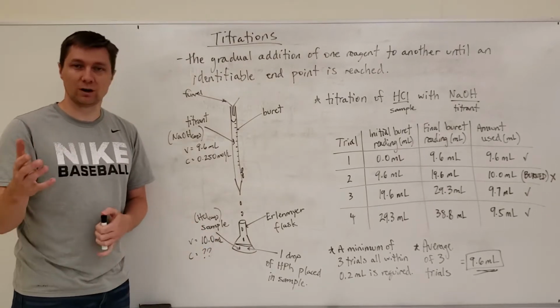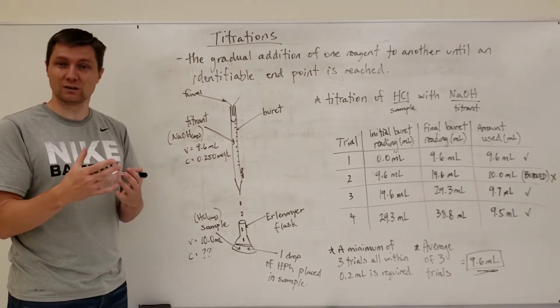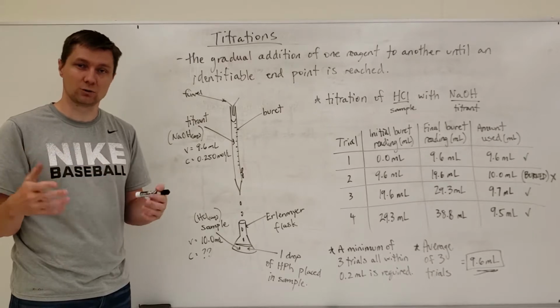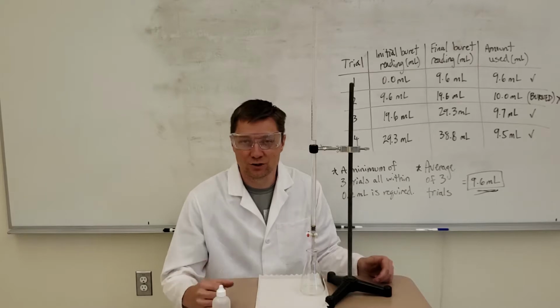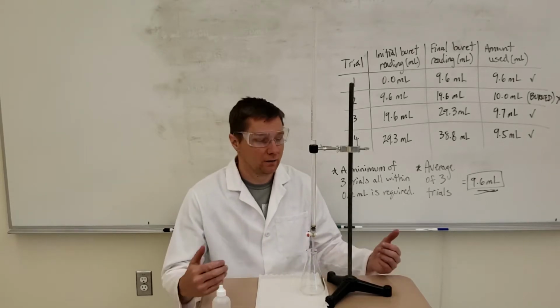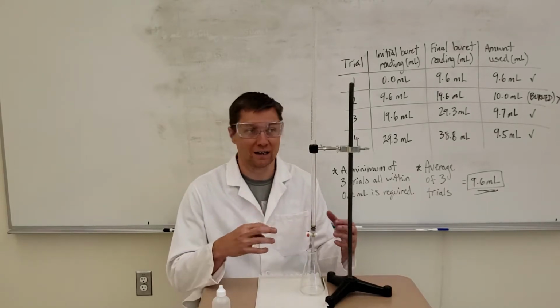And so in the next couple of clips, I'm going to demo for you what this titration really looks like using the actual equipment, and then we'll look at some titration curves as well. Okay, so just a short demo for you guys on titration, what it looks like exactly with the apparatus.